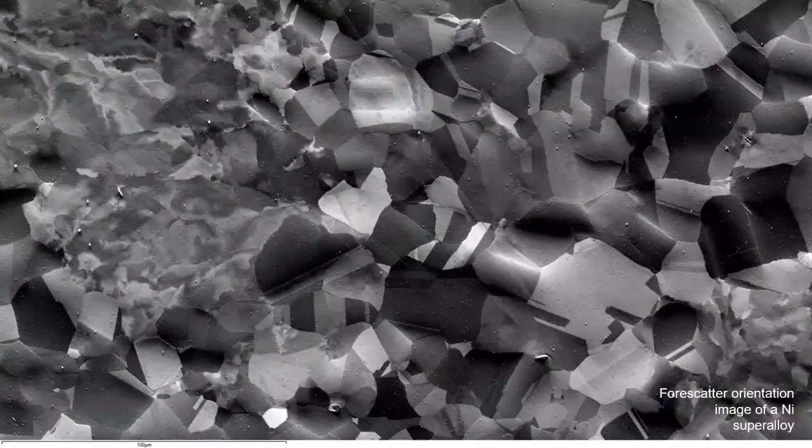So this is an example of a forward scattered electron image. This is in black and white. You can also have it in color. By applying red, green and blue to those three lower detectors, you can get a false color image.